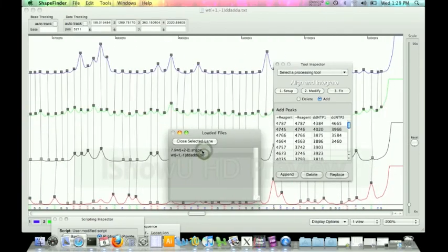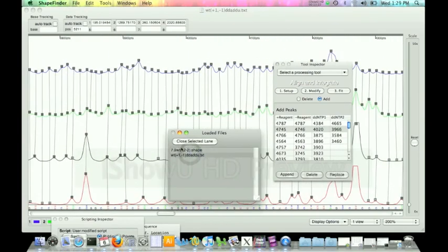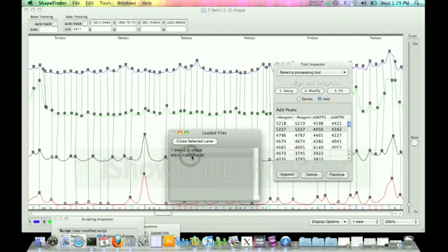So again, you click back and forth. You can see the peaks themselves are getting a little taller. That's okay because that's just general variance in the data. But essentially, if you look, the peaks aren't moving. There's no peaks that are being added or deleted. You're really seeing the same shift between the data sets.